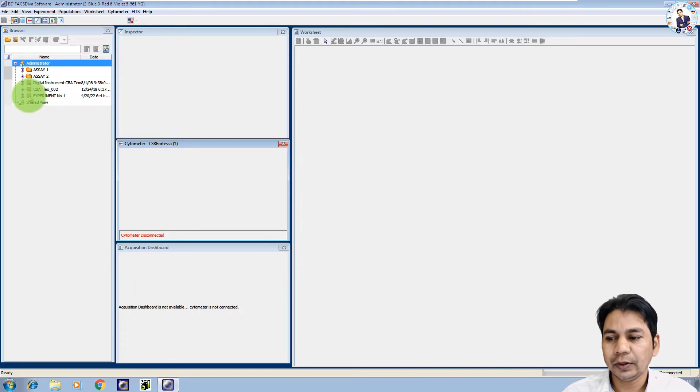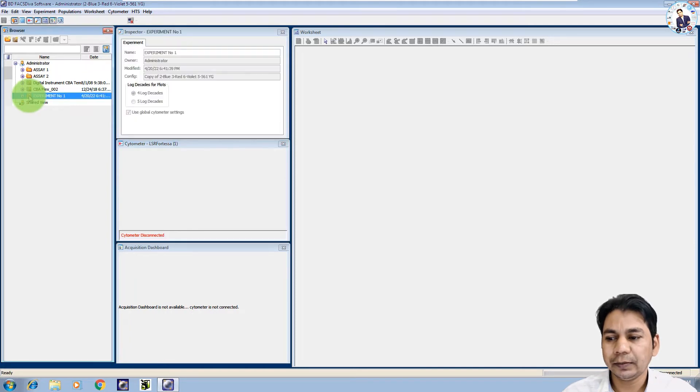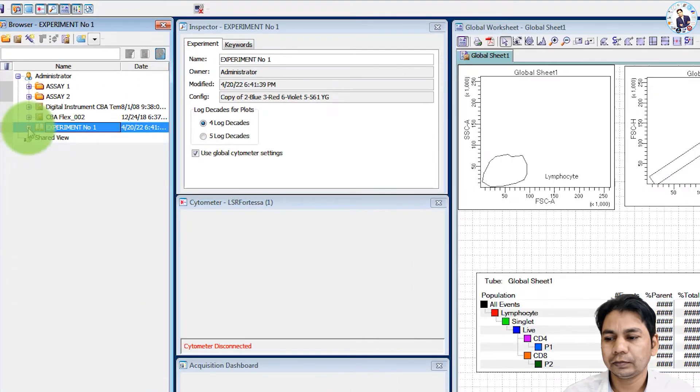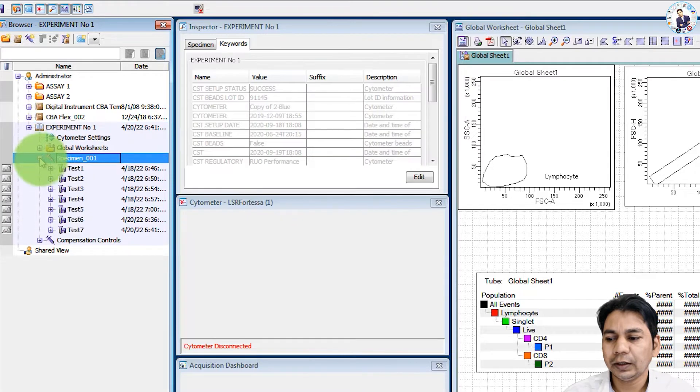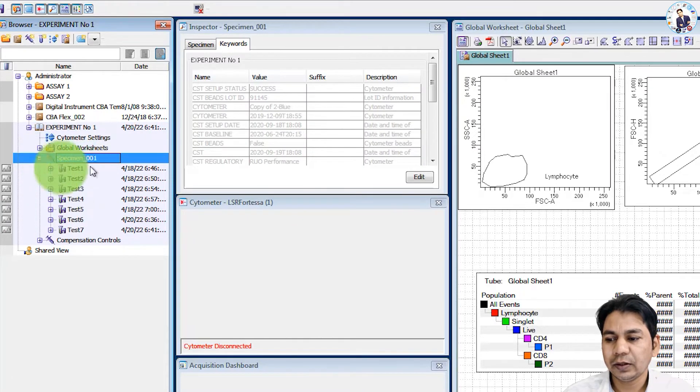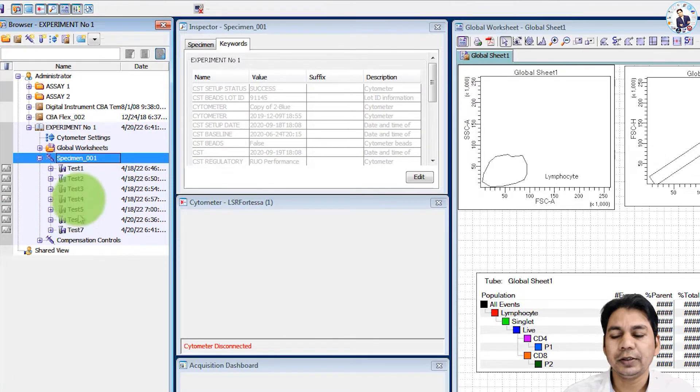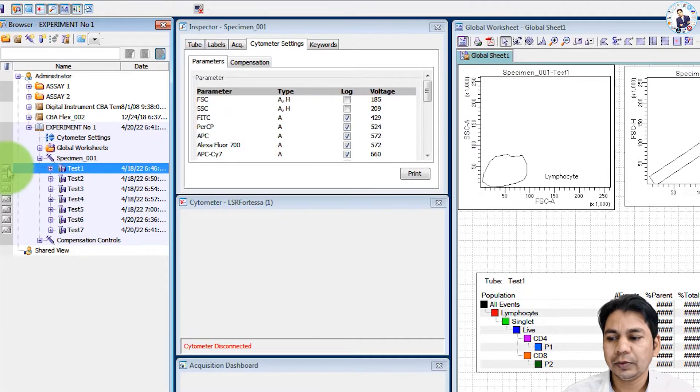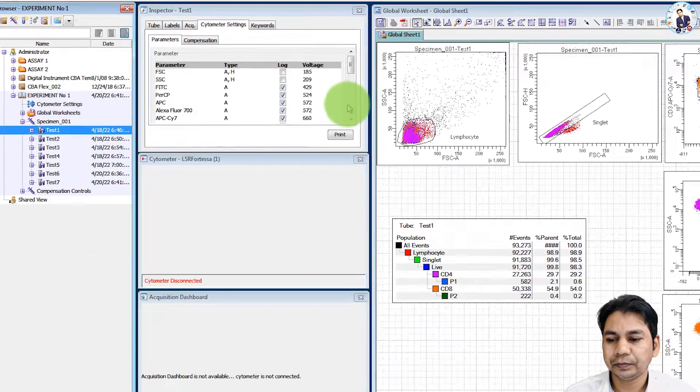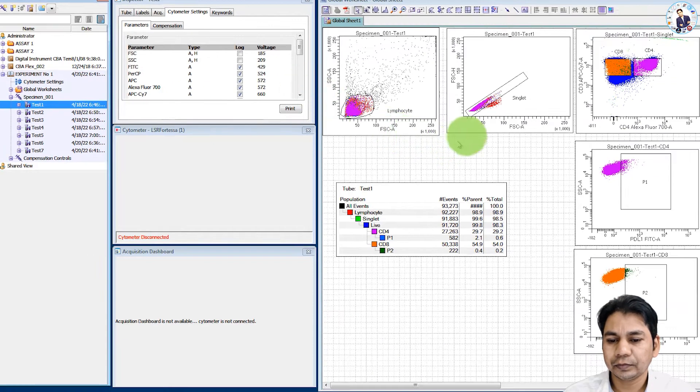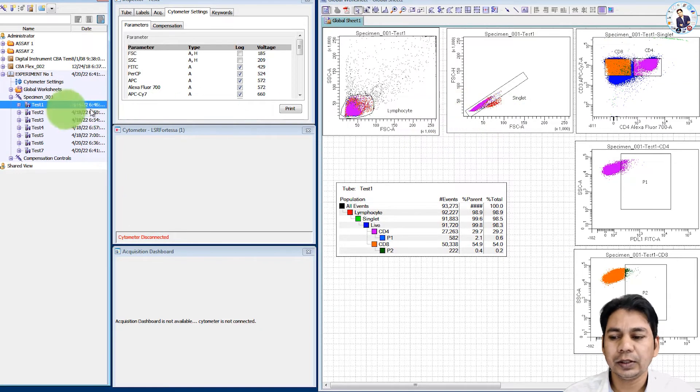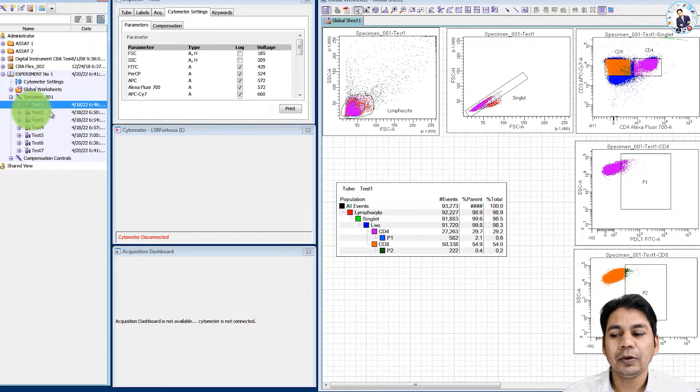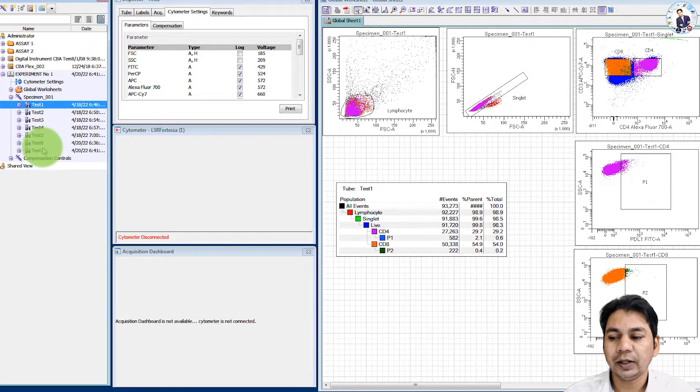First I am going to open an experiment. If you click here, specimens one, you can see I have seven test tubes acquired in this software. So if you click here, you can see the data present in this test one and I am going to show you how you can export these files.